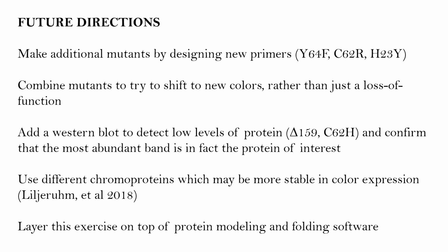In the future, we hope to make more site-directed mutagenesis and maybe combine the mutants that we already had. We could also do more experiments to confirm whether the most abundant band is in fact the protein of interest. We could also try using different chromoproteins other than aeBlue, which might be more stable in color expression. Lastly, we can layer this exercise on top of protein modeling and folding software.